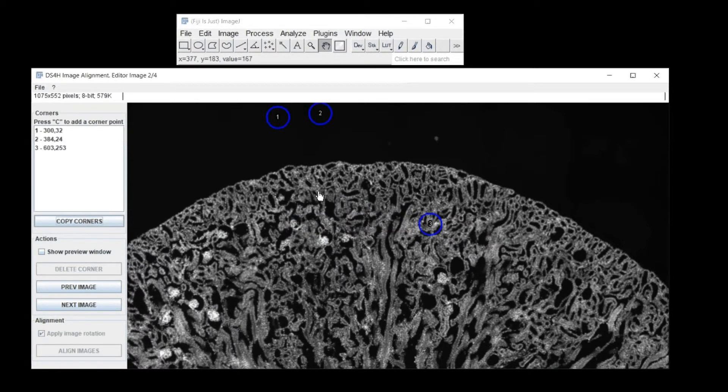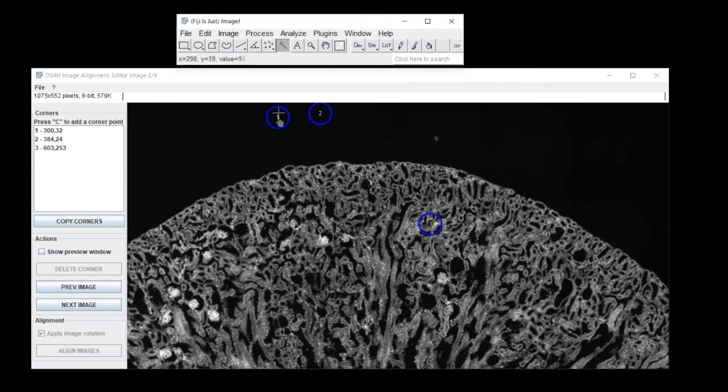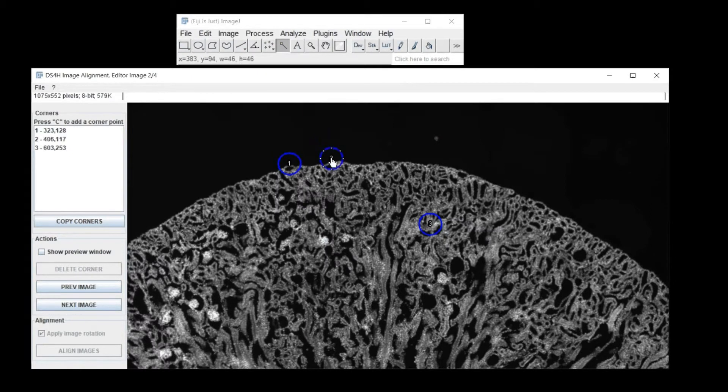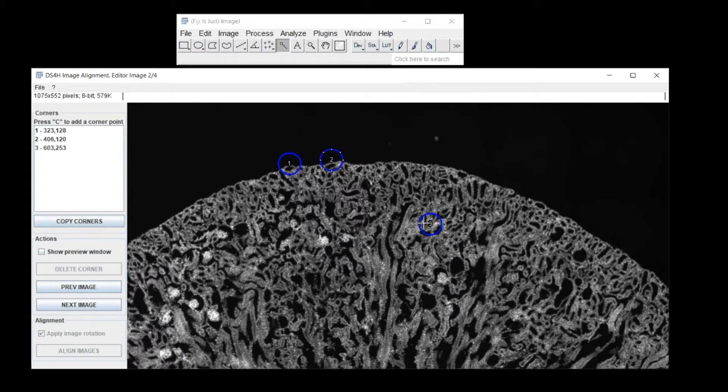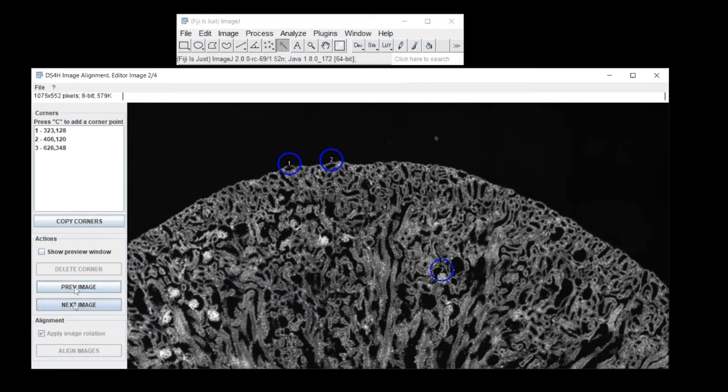If you have some channels already aligned, just copy the corners you define in one of the channels with the Copy Corners button. Note, the corner with ID 1 must represent the same point of the object in all the images. Same discussion for the other points.